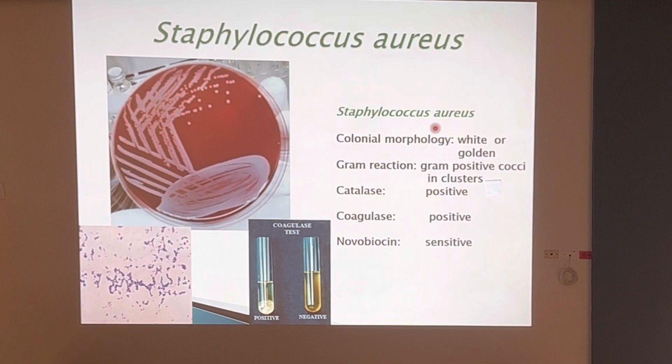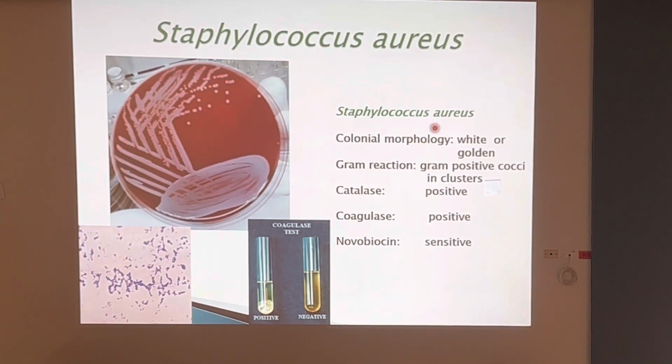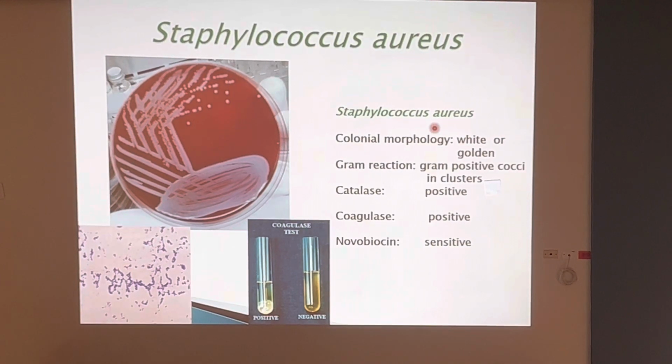All staphylococci are catalase positive. So when I get a gram-positive cocci from my gram stain that grew on my blood agar, I know that I have either staphylococci or streptococci. Those are the only 2 aerobic gram-positive cocci that you need to know right now. Good?